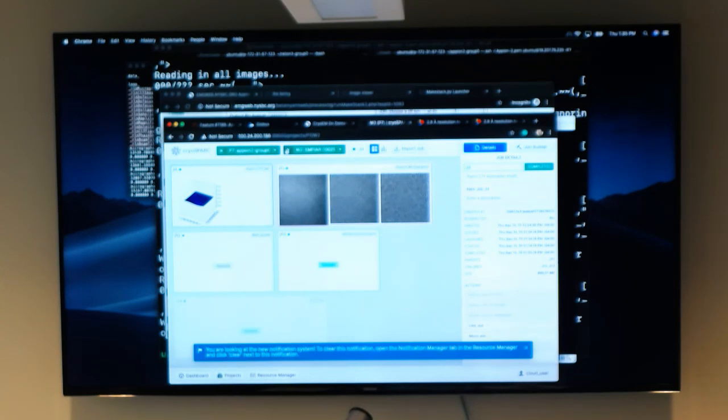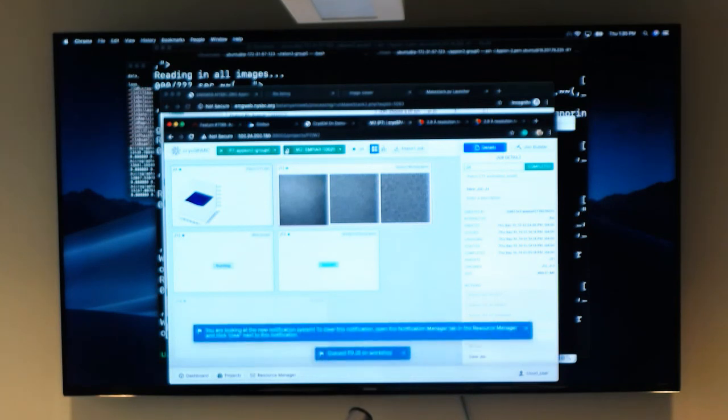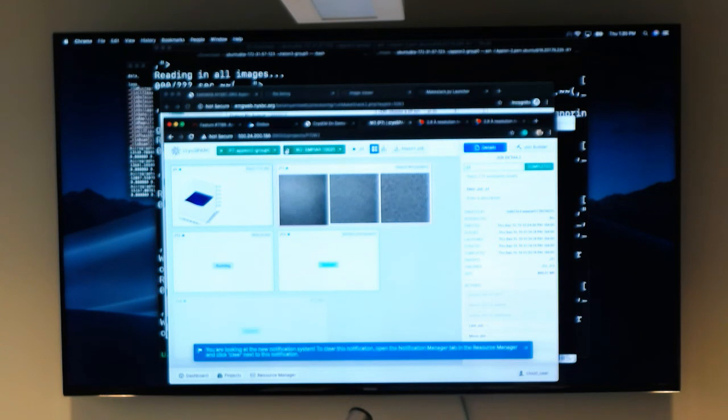So we use this one, the good one, because every time you don't need to configure the file on your machine. Or maybe they are wrong. It is in the network file.